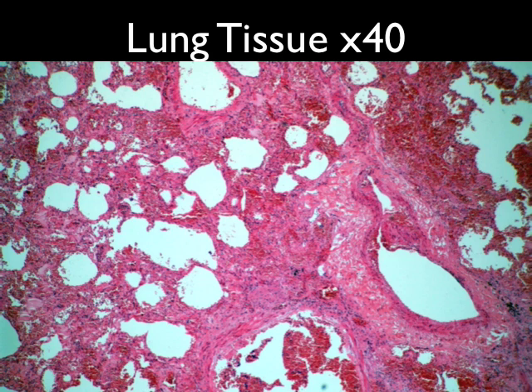They're too small? No, because I can see them on the other cells. Why not? They're not there. So the cell doesn't have a nucleus? Yeah. Good question. That's a possibility, but it's not the correct one. Anyone else? Say again? Different kind of cell? Good idea too, but no, it's not the correct answer. It's dead? Another great possibility, but still not the correct answer. Not sure still. It's a mutant.